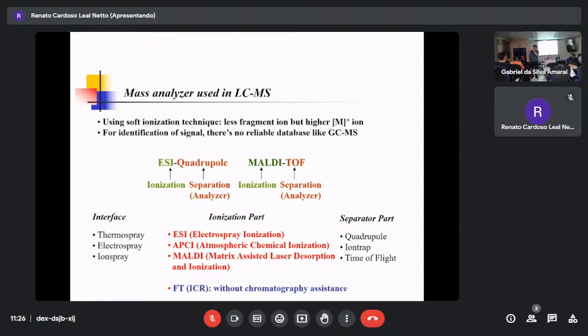Corona, another special device, ionizes the solvent, because now I injected chloroform hexane instead of water, since lipid is not soluble in water. Chloroform hexane is not a polar solvent, so it cannot ionize the sample by itself.